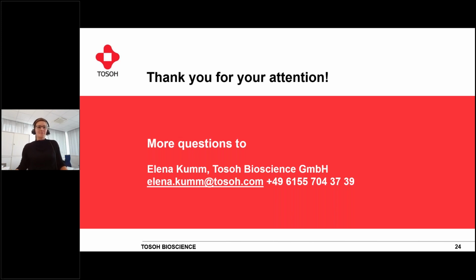That's perfect. We've got one here. Do you also have IMAC columns? So I guess that's immobilized metal affinity chromatography columns. That's a good question, because when I was at university, I was working with these. Unfortunately, we don't have them, so you can't do that with our columns.